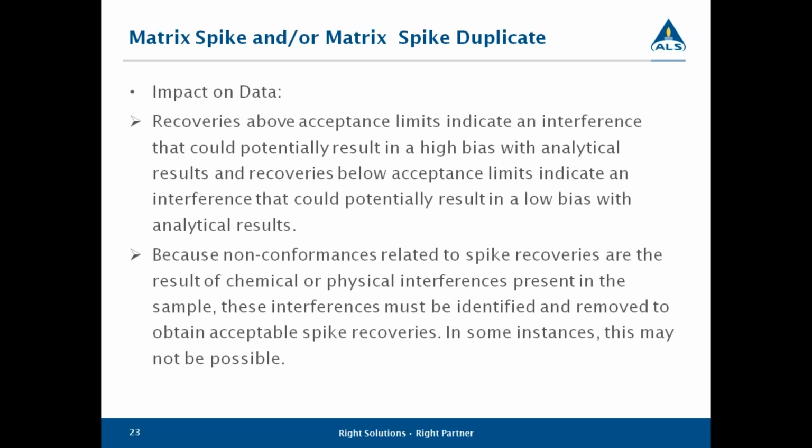I feel it's really the best way to determine if there are any interferences in your sample, because that's one of the biggest obstacles you have to reporting true defensible data: whether there is an interference or not.